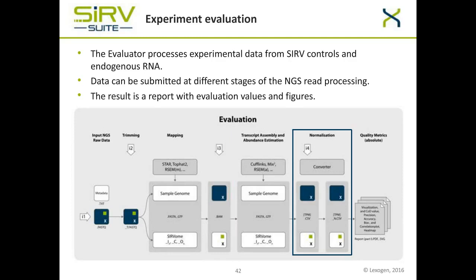And this normalization step I will explain on the next slide, whereas the output of the evaluator is a report and of course all the data files required then later on to compare experiments.